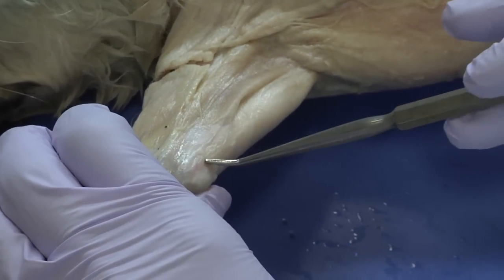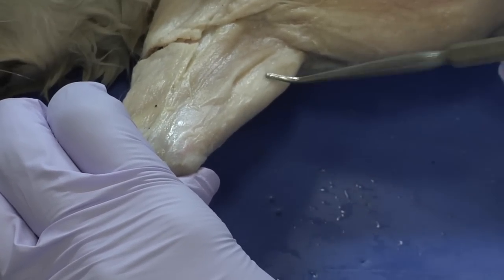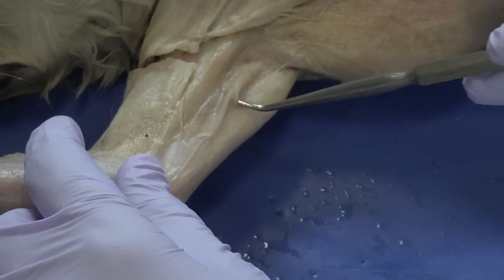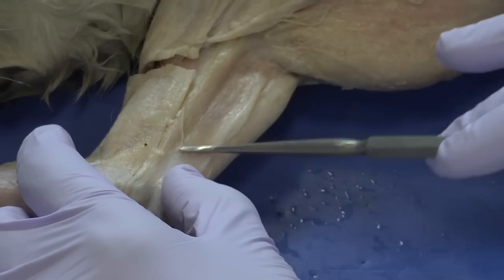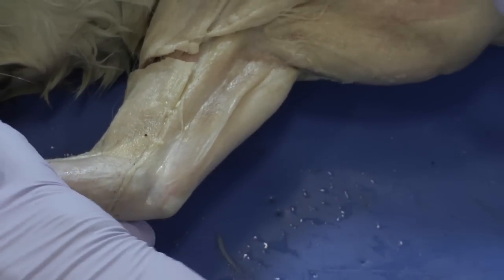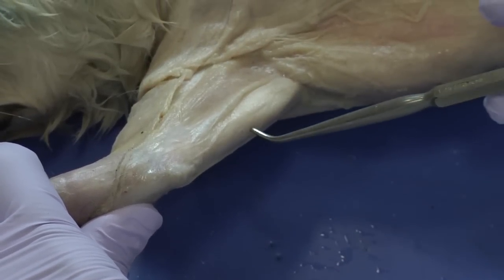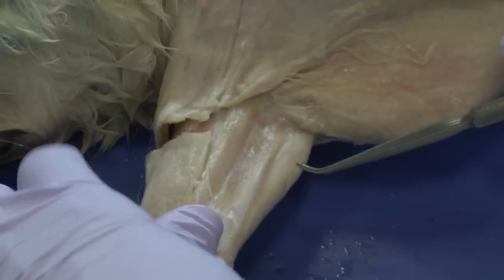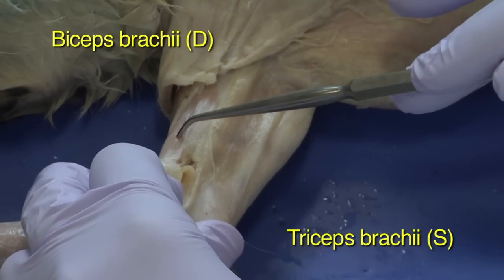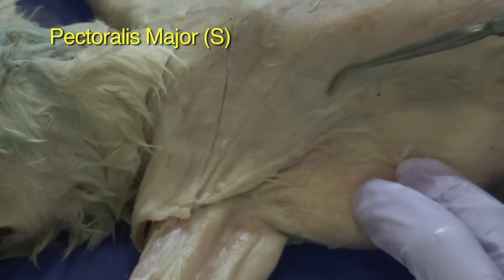You can see the triceps here, and this is a sufficient reveal on this muscle. Alternatively, to see the entire group, this very thin superficial muscle can be removed — but I'm not going to, because there's enough of a reveal on the tricep. So we have the triceps brachii, the biceps brachii, and here the pectoralis major and pectoralis minor.